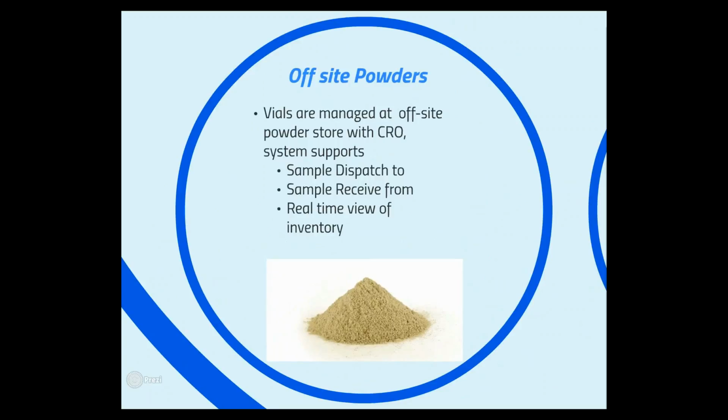In this particular environment, we're using an off-site powder store that's located out with a contract research organization where vials of powders are managed, and then they're shipped and dispatched between the host organization and the CRO, and then back and forth. So we've got to manage the sample dispatch process, receipt process, and also make sure we have a real-time view of the inventory. So that means making sure we're kept up to date on any inventory changes, both at the contract research organization and also internally as we use the materials.